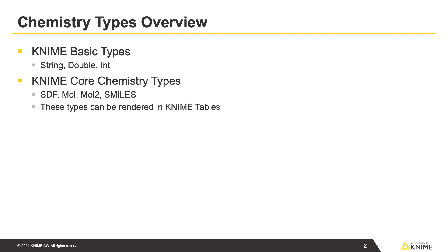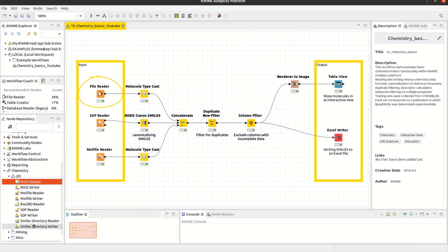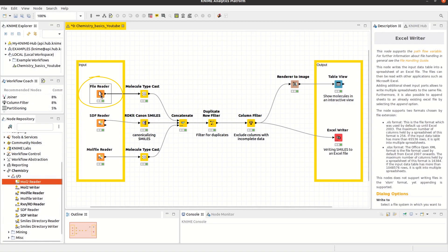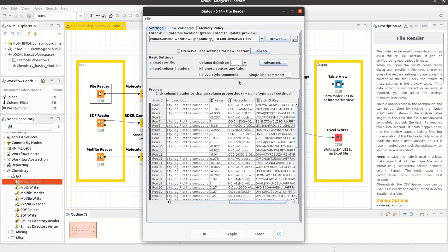KNIME provides various nodes to read in chemistry data. Starting with the file reader, which is a native KNIME node, it is possible to read in different file types, such as text or CSV files.